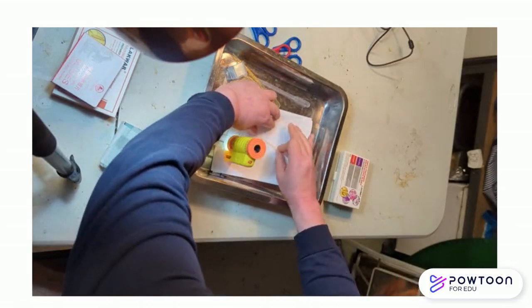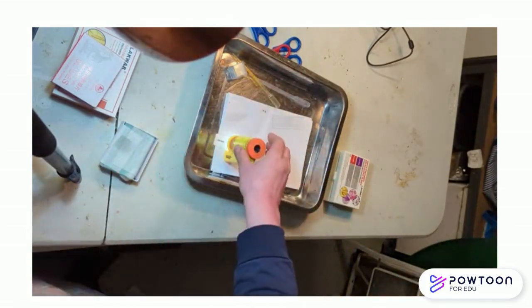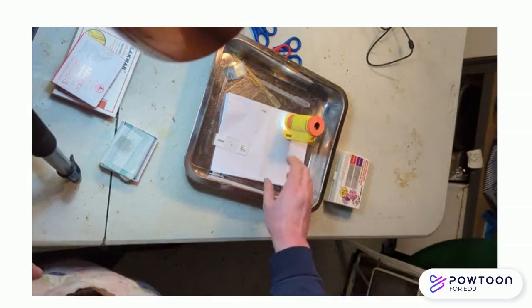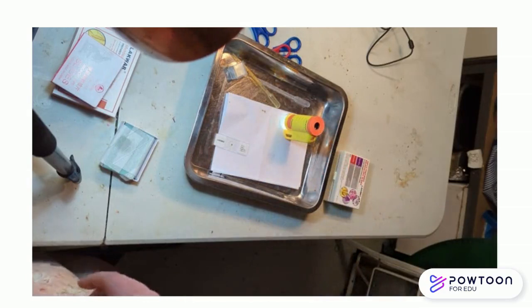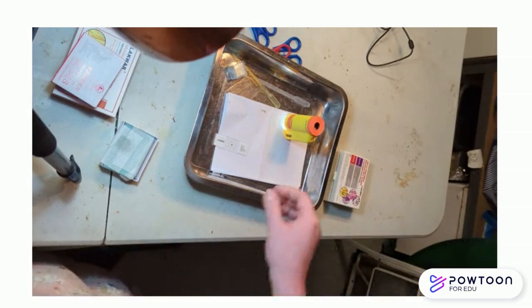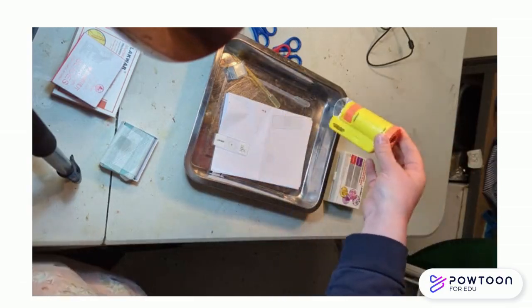Once you've done it, again, you take your microscope, and again, you get them to bend down and to find the right focus and the right magnification. It seems simple and it's not difficult, but it really requires a lot of patience. Make sure that you've got one per each group.